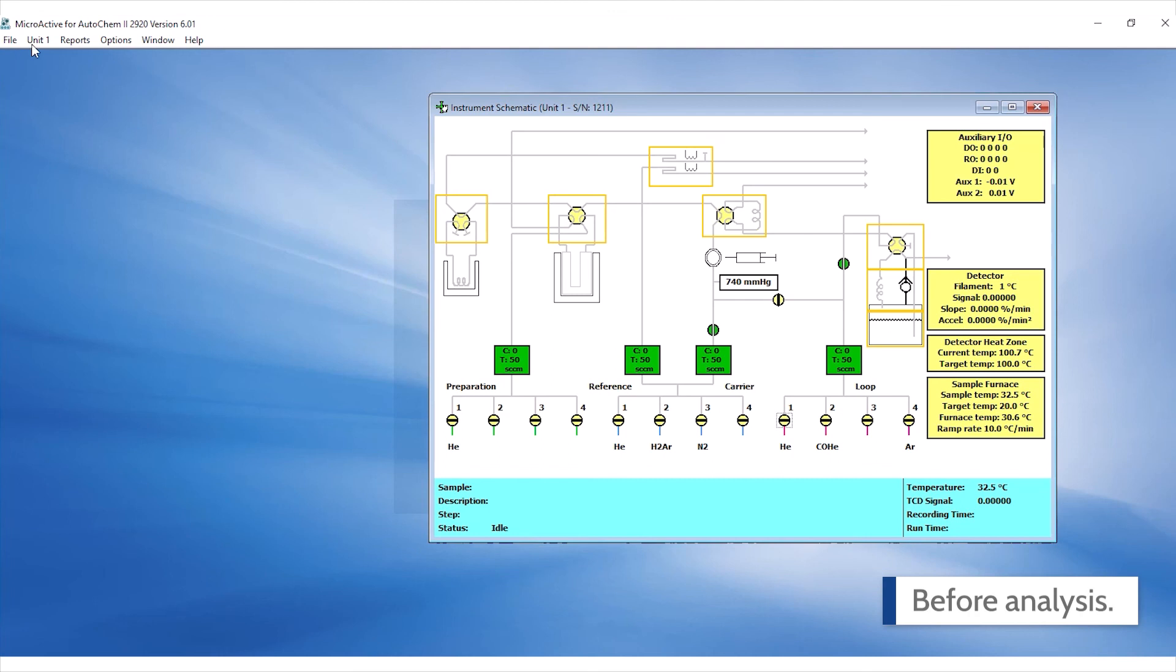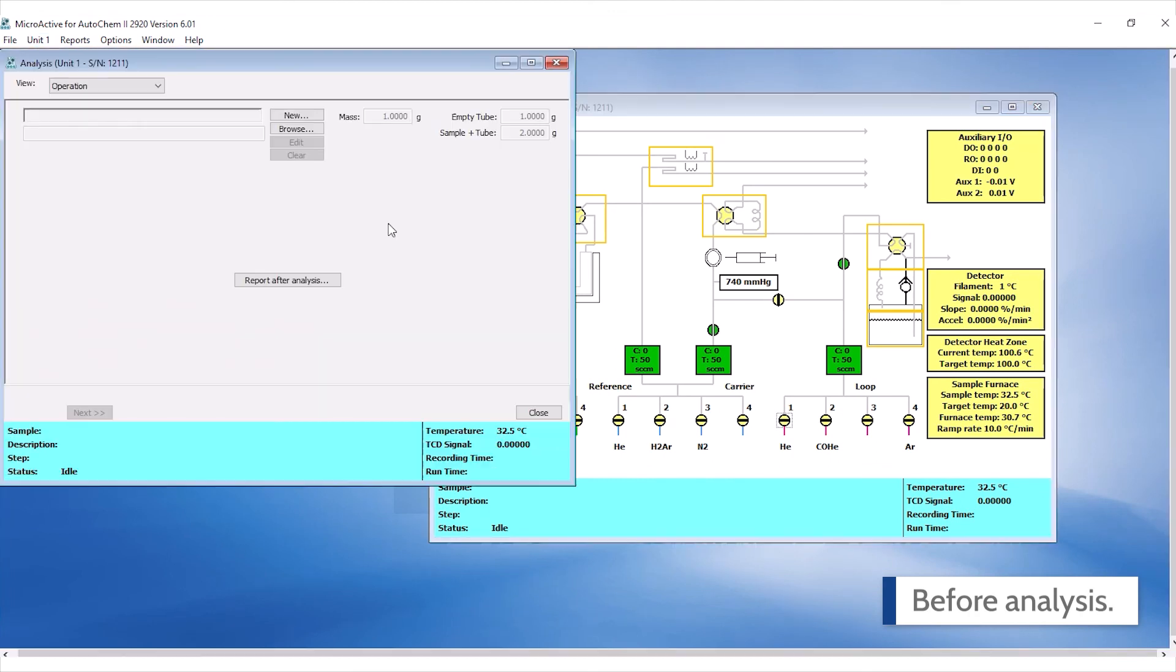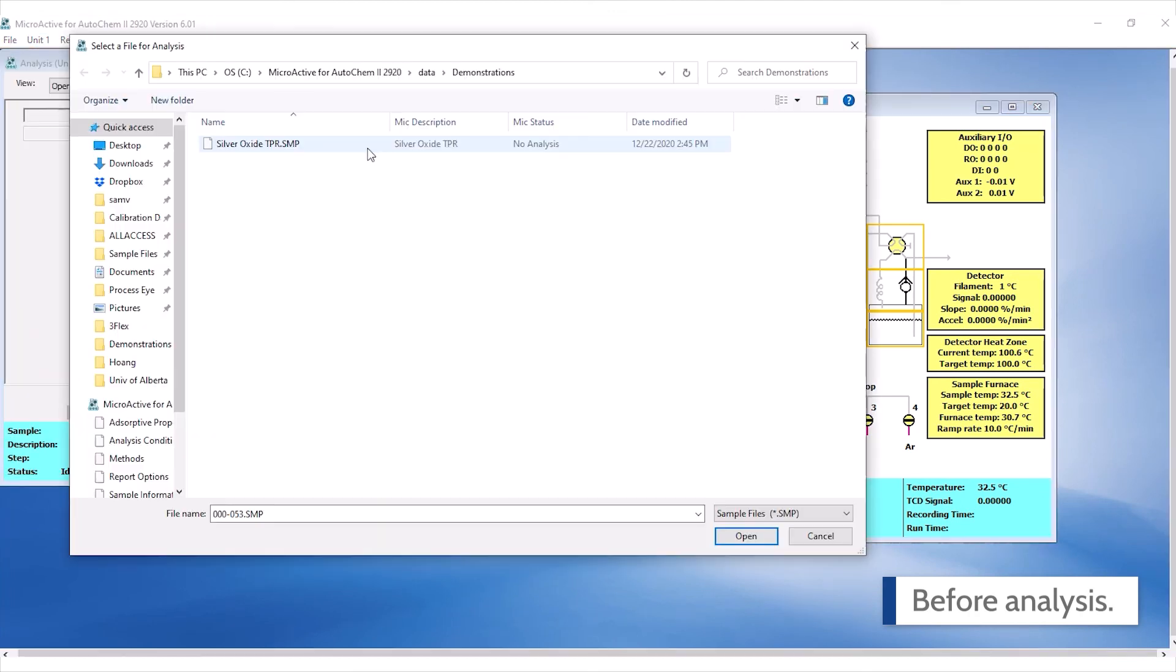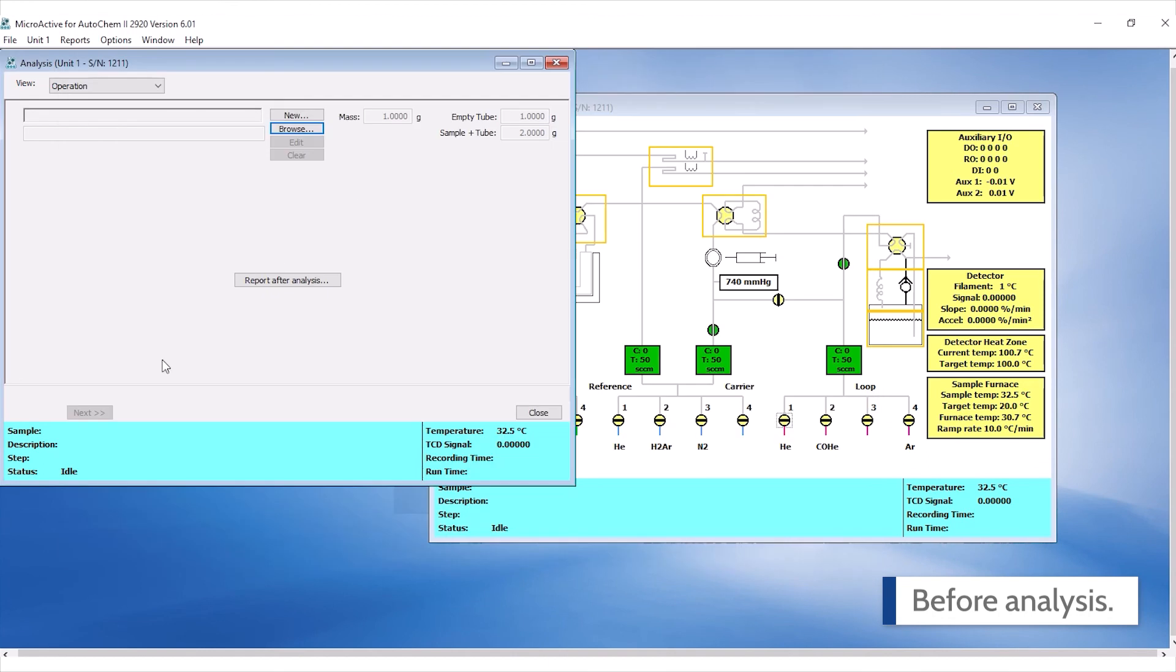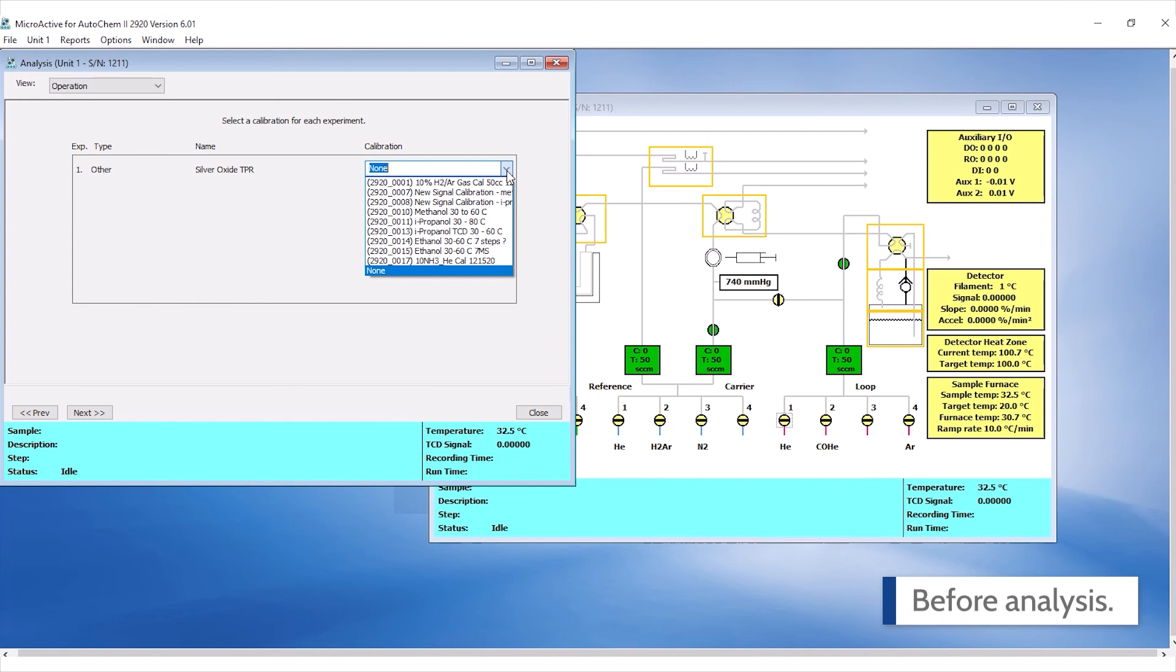You can apply calibration either before or after an analysis. If you have a completed calibration file before analysis, you can select the appropriate calibration curve when starting the analysis.